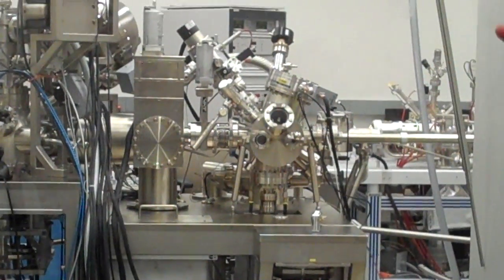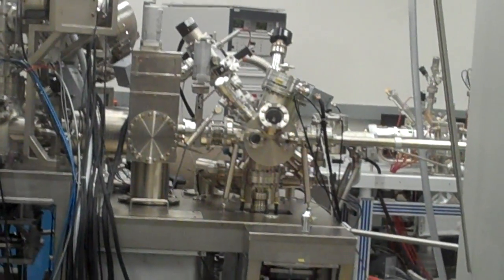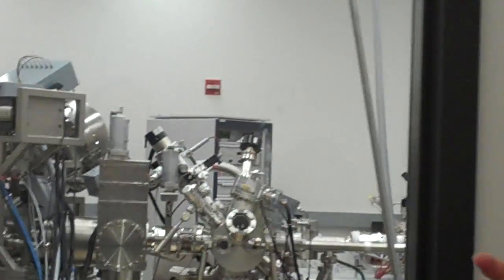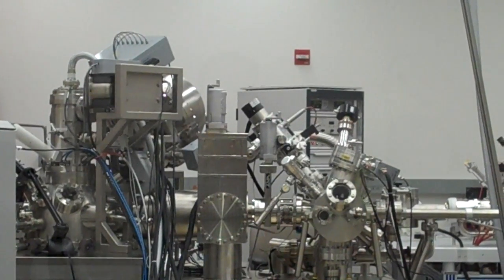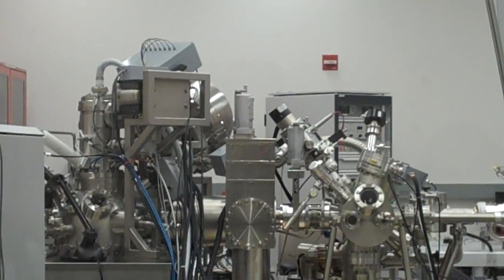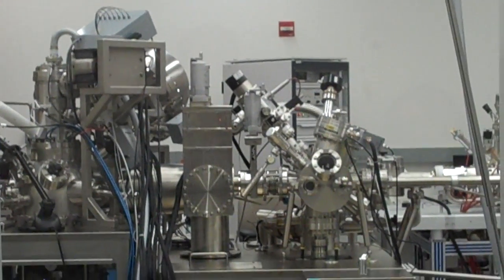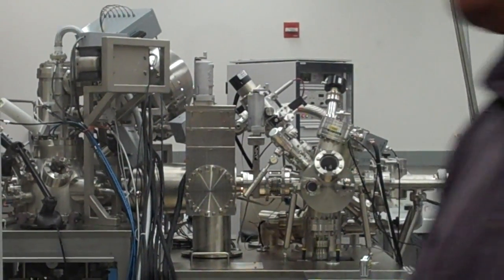They also have some other facilities at the synchrotron where they use x-rays to probe surfaces. They have something down the hall - it's another STM that is low temperature, cryotemp, so that you can study things at low temperatures. And then it has a laser. You can excite the materials on your sample at low temperature, see how the electrons jump around, and then study them with a scanning tunneling microscope. I'm sorry, I'm running through the end, but I think we're out of time. So why don't we head off this way?